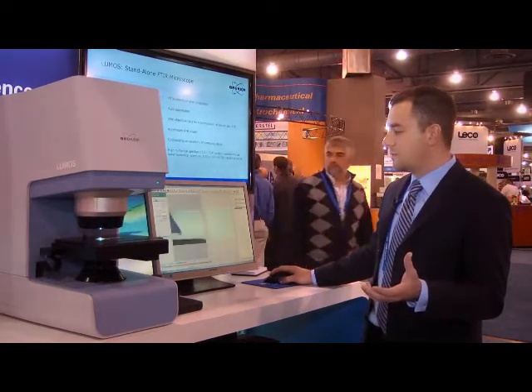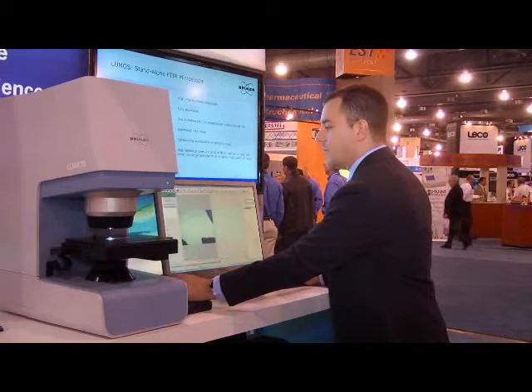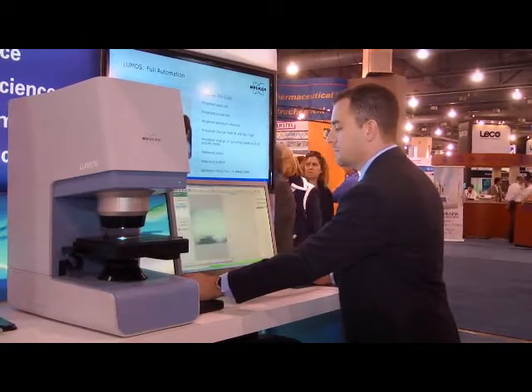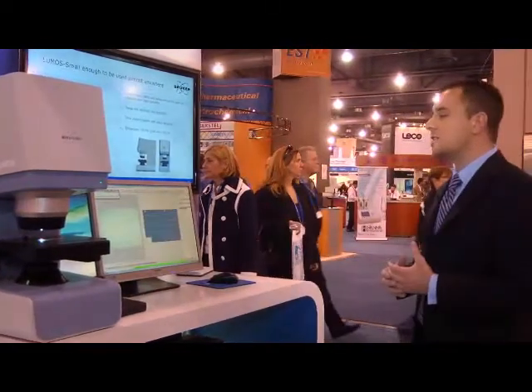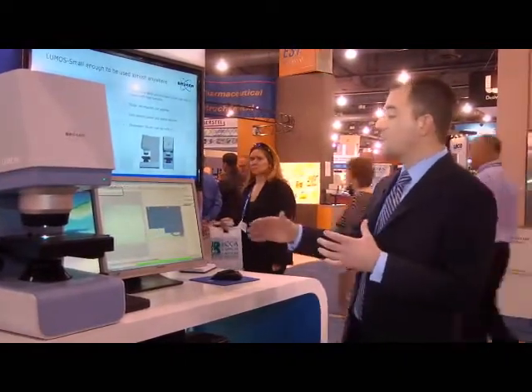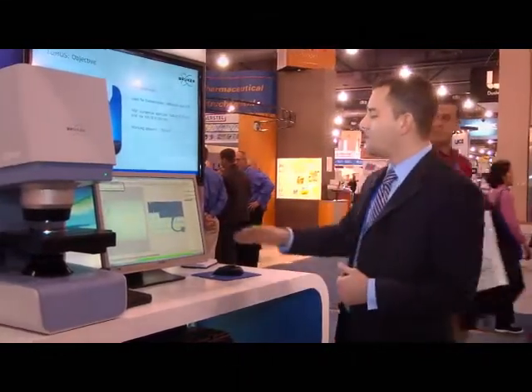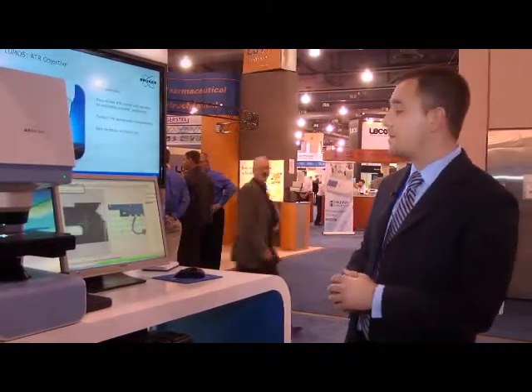By deactivating the zoom and building a larger image, I'm able to click on this, add border points, and then I'm able to collect a larger image. And this could be really useful for looking at different particles, different areas of analysis on the sample. By building a large image, you're able to really hone in on maybe what this little particle is here. This looks like a fiber, probably from my jacket over the course of the day. But you can see the stage automatically moves to all those individual positions, building us a nice large mosaic sample.